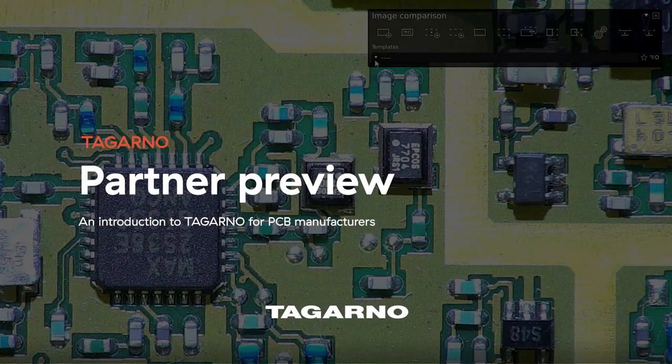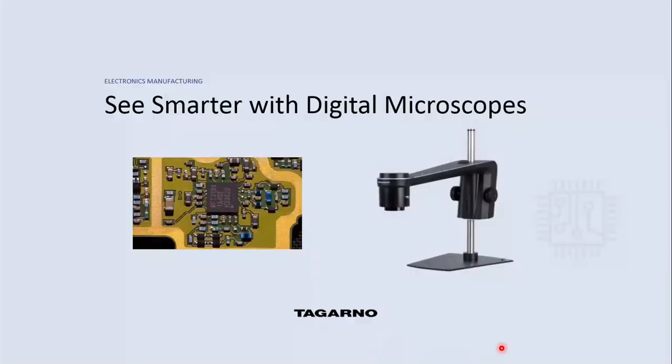I'm going to talk today about digital microscopes and how they're beginning to overtake optical microscopes on the production floor, and give you an idea of the reasoning and some of the benefits of a digital microscope.